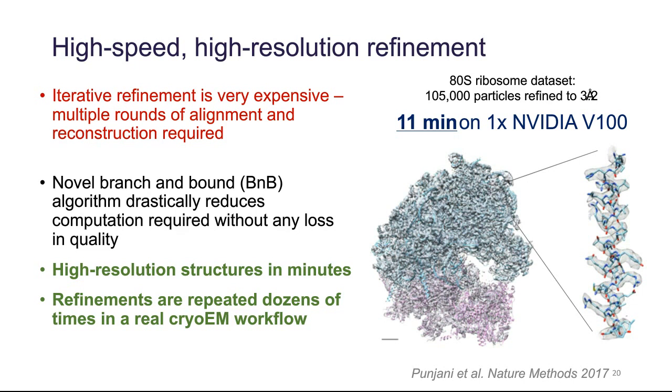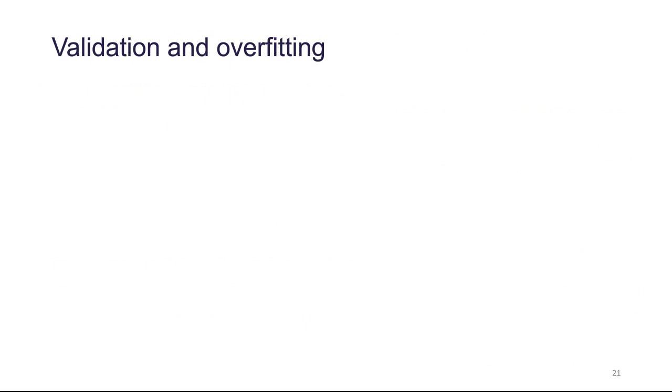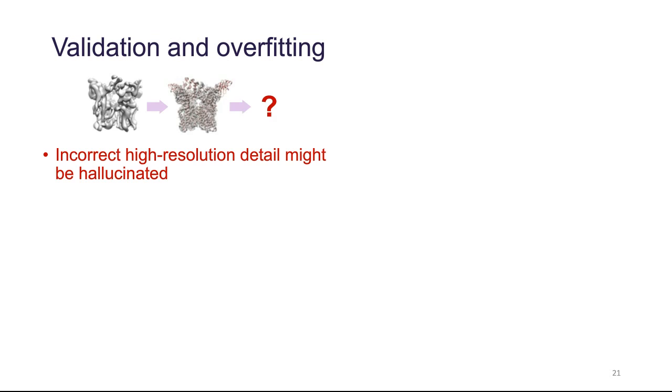The third issue with the expectation maximization algorithm is that repeating iterations can cause noise from the experimental images to build up in the reconstructed structure, which then affects alignments in the next iteration, and eventually can yield incorrect high-resolution detail in the final result that is not actually present in the data. This problem, known as overfitting, is a common and very deep concept in statistical inference generally.